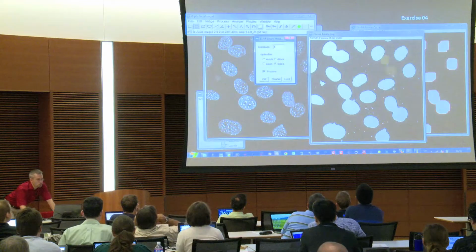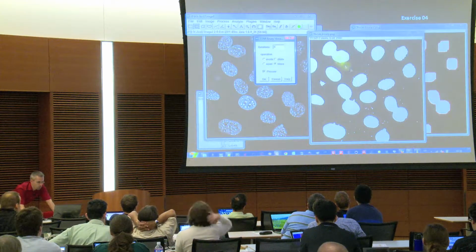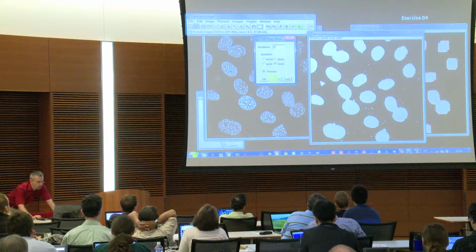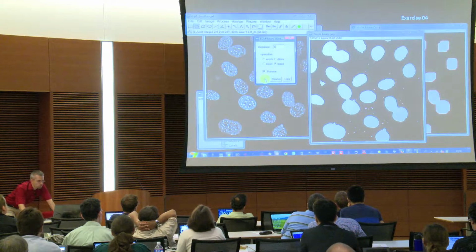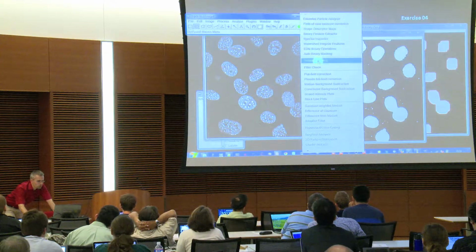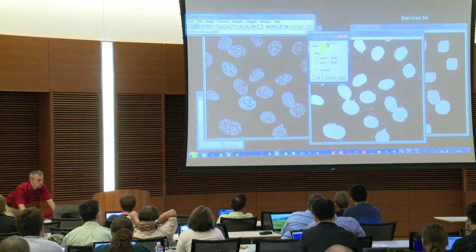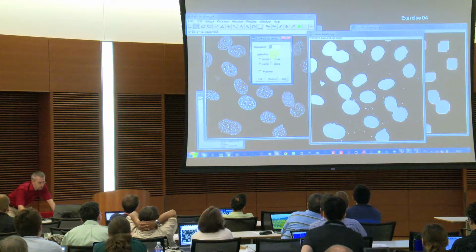And then you see here, it does very similar. So it closes that, creates connections, but keeps the outlines already a little bit more roundish. So I accept that first. 5 times iteration, close. And then I do again the same function, Toolbox, EDM binary operations. I'll go to open, and I did it, I don't remember, 12 times or so.